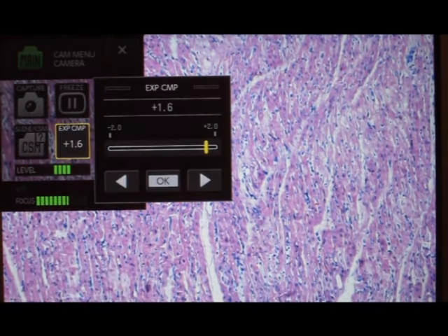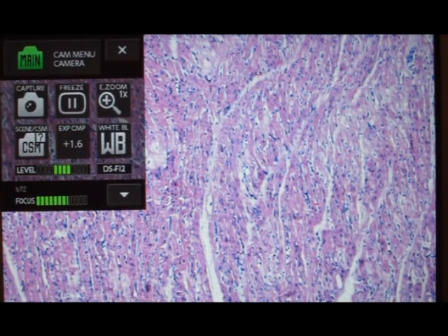The image can be darkened or lightened as well. Once you're satisfied, just click Capture.